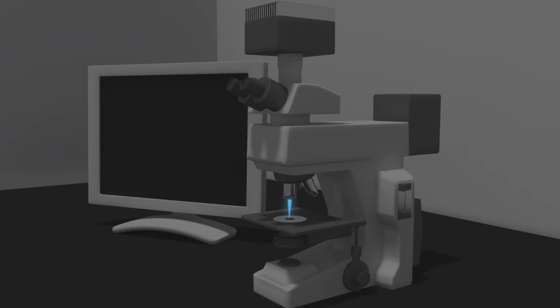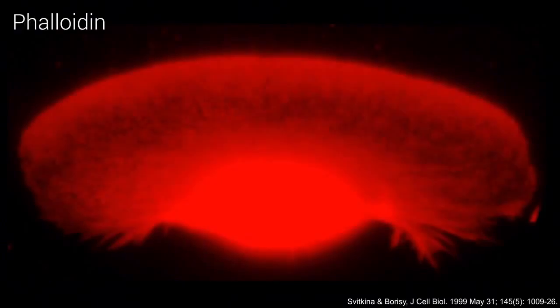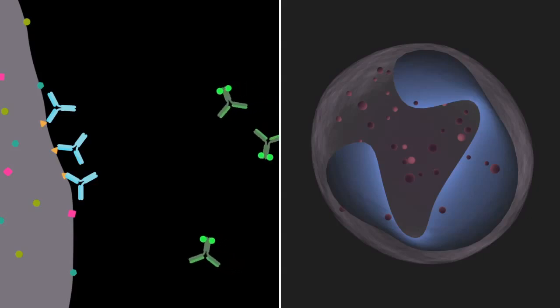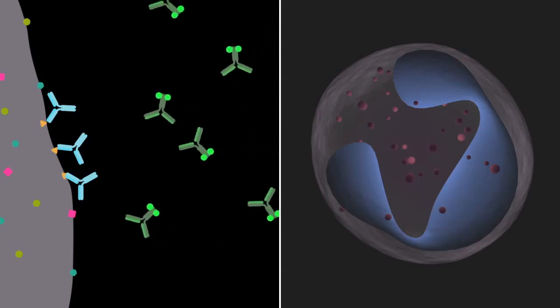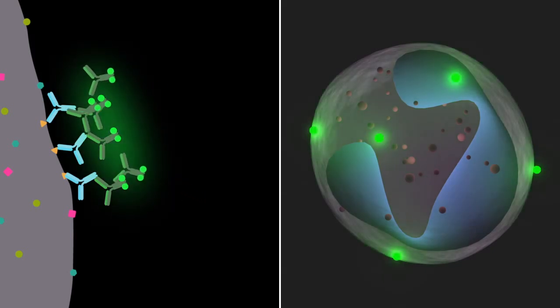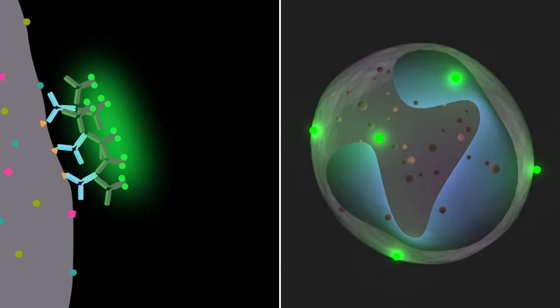One example of a commonly used fluorescent dye is DAPI, which binds to DNA, and a second example is phalloidin, which binds to F-actin. Expression, modification, and/or localization of specific proteins can also be visualized using immunofluorescence, or IF. Like immunohistochemistry, IF uses multiple steps to detect specific proteins using antibodies in the sample. In IF, one of the antibody labeling steps utilizes fluorescently tagged antibodies that are detectable upon excitation using the appropriate wavelength of light.